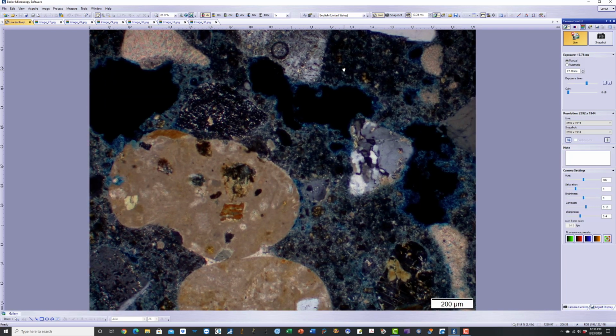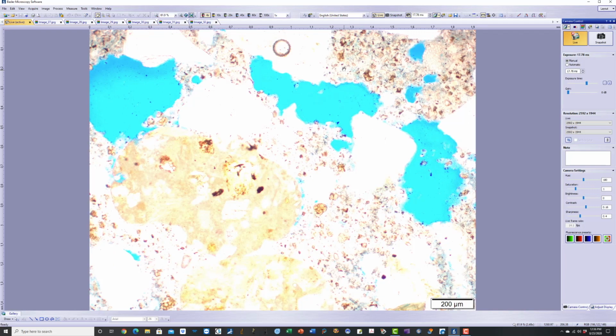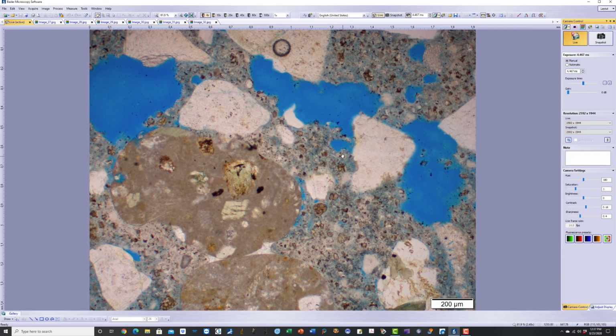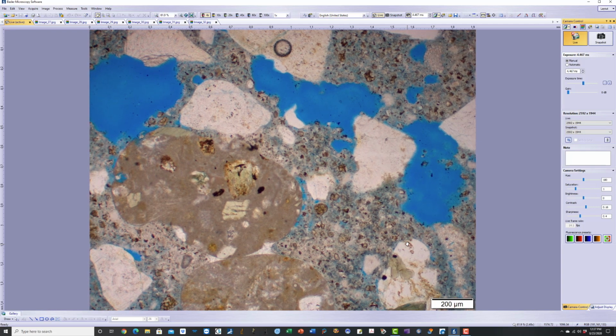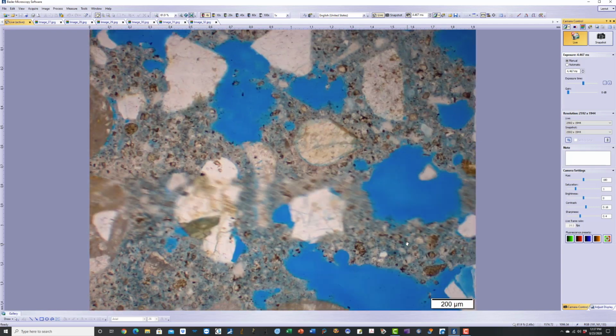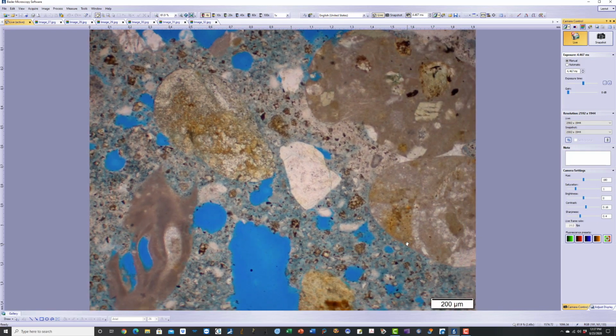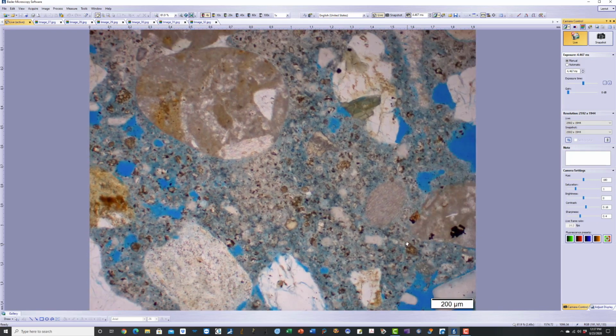You can see a lot of residual cement particles still present in the mortar coating, which could have been hydrated to densify the paste. That would have reduced the degree of carbonation and been more effective for prevention of migration of corrosive agents.